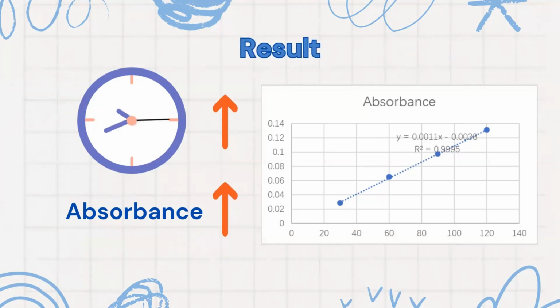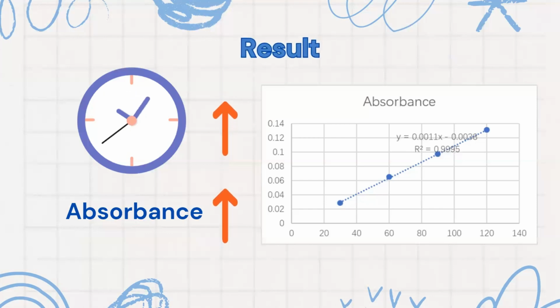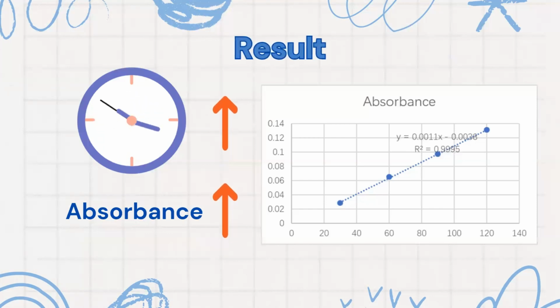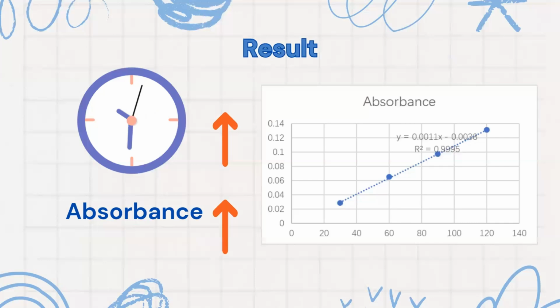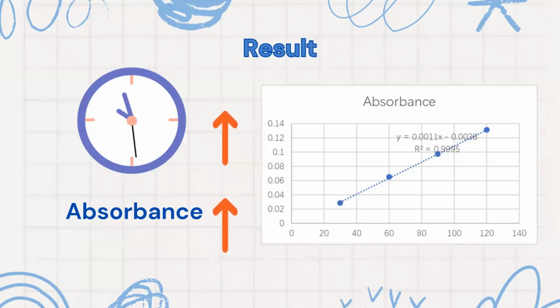After obtaining the figure on the right, the enzyme activity value can be obtained by fitting the slope of the straight line, and it is concluded that the longer the heating in the range of experimental time, the higher the reaction degree will be under the set temperature in this experiment.